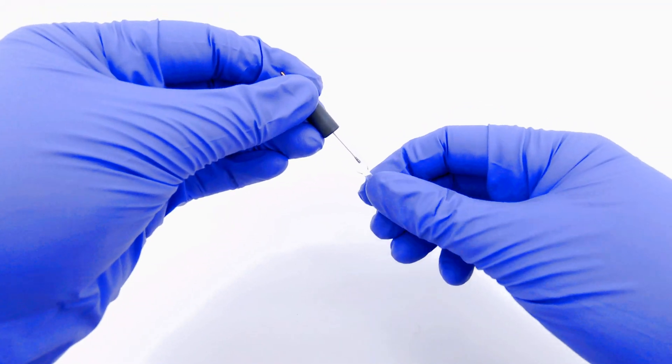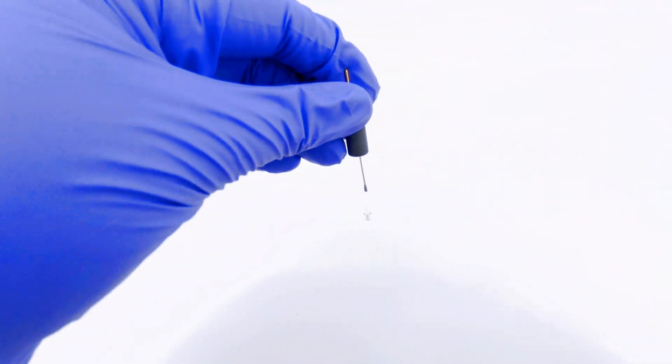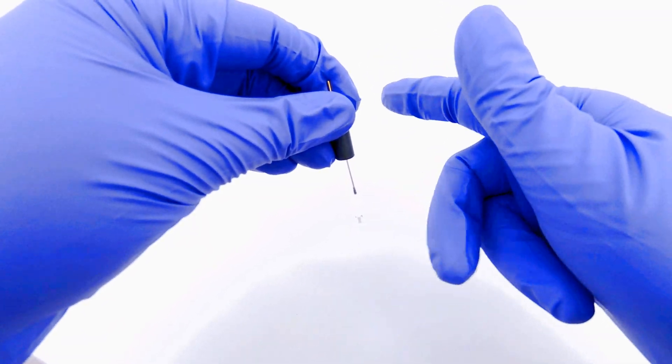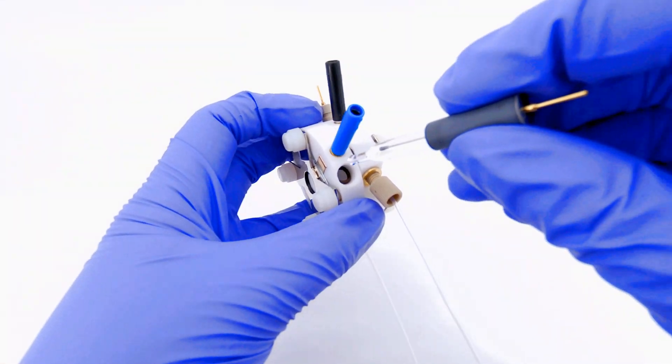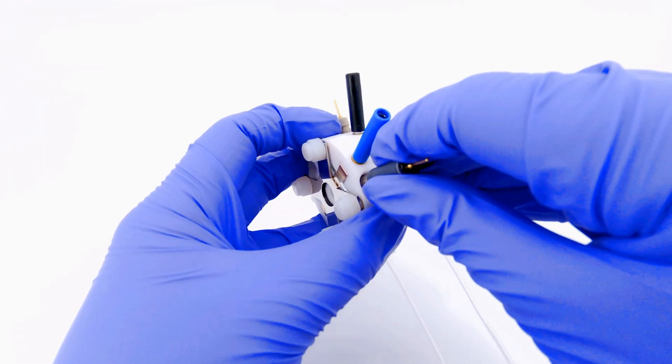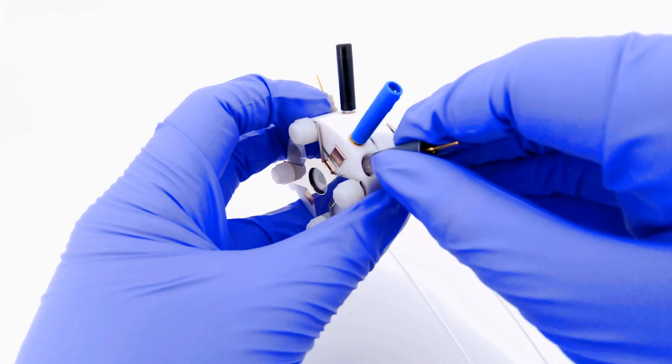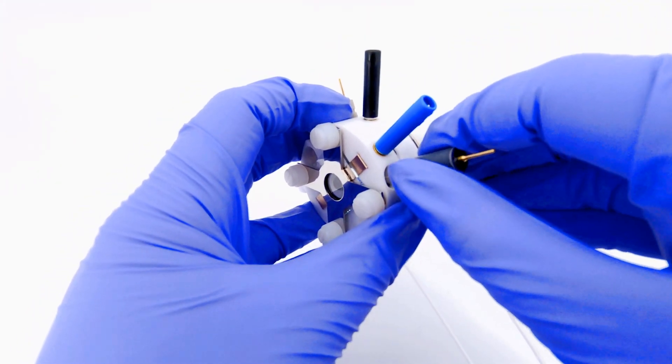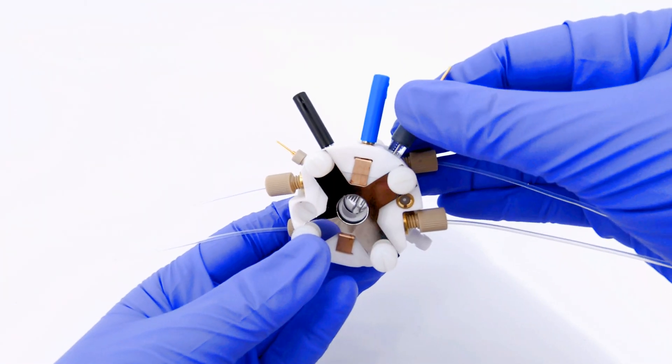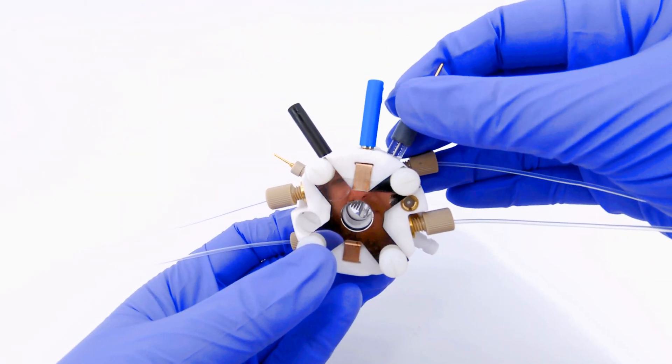Before placing the reference electrode into the cell, make sure to remove the cap and tap to remove any trapped bubbles by the frit. Then, push the reference electrode in by applying pressure and twisting. Make sure the frit of the electrode is approximately halfway into the cell chamber.